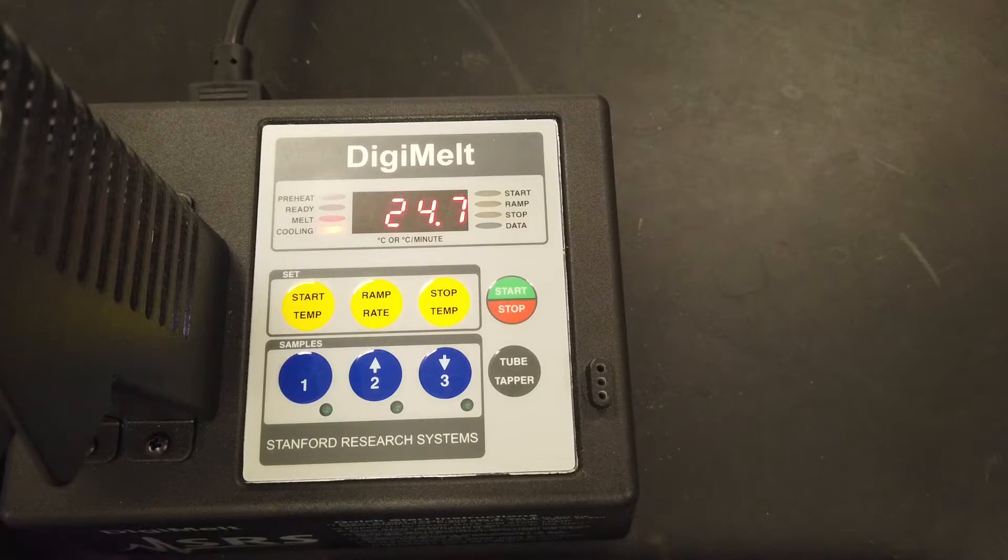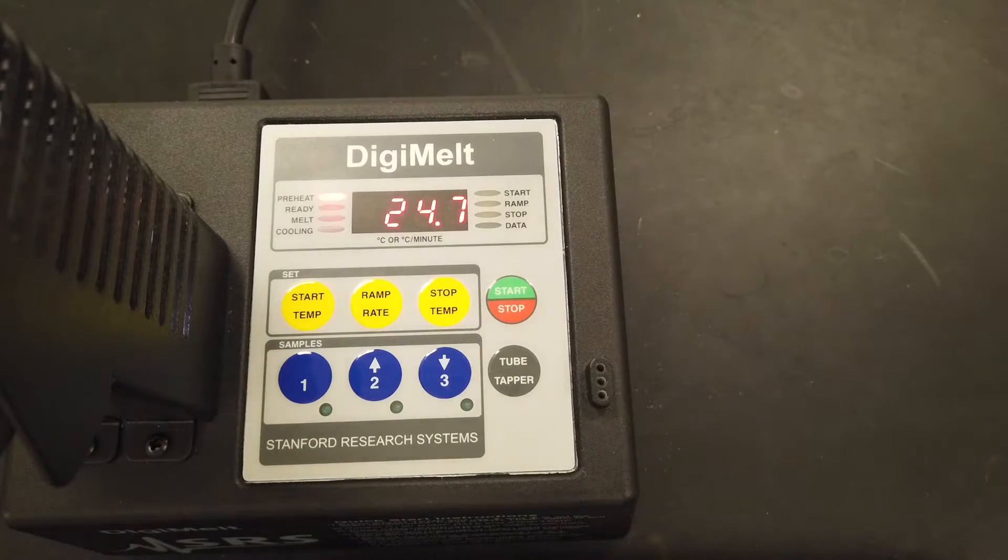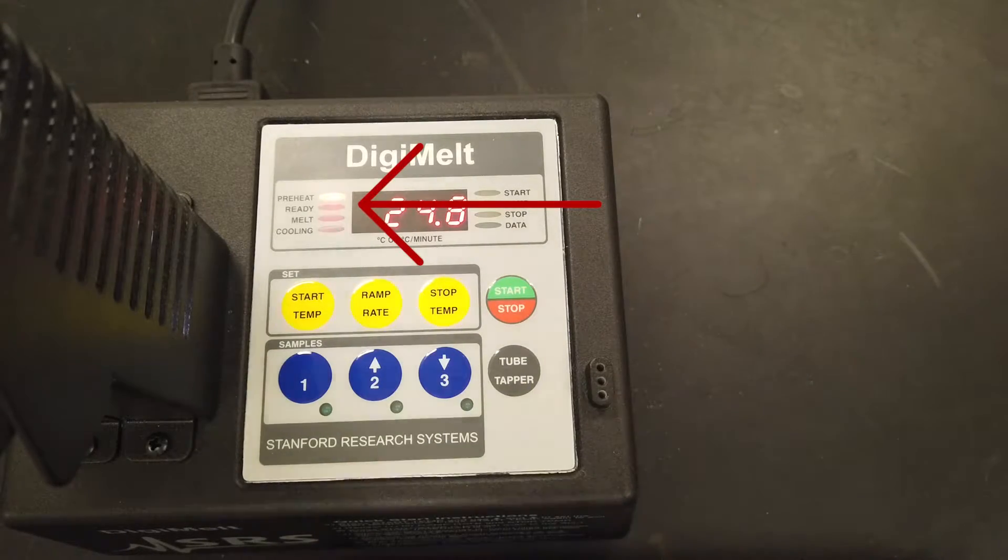Once you've entered the parameters, press the start button again and the Melt-Temp will begin to preheat as indicated by the red light next to the preheat label.